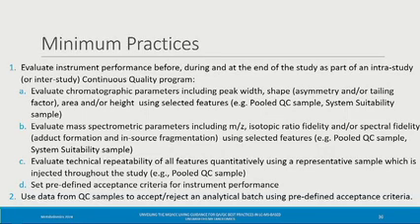Yes, thank you for this very nice presentation. My name is Audrey de Gouelec, and I have a question not regarding these minimum practices. My question is, can you give us any recommendation on the acceptance criteria you mentioned to be used for the QC pool? I mean, you mentioned percentage of RSD, and what do you think the value should be?